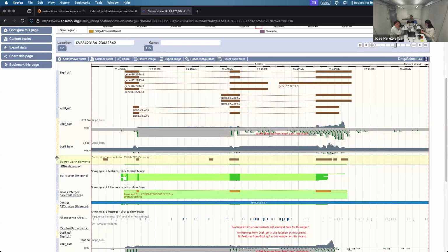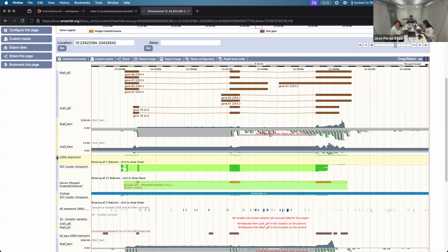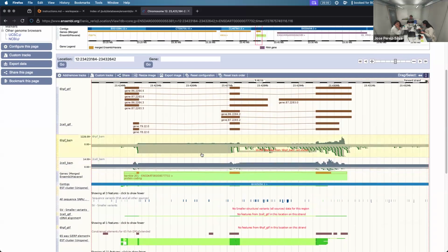So this is one of the things we wanted you to see today, a very quick usage of a little amount of data, and you can already tell how greatly different this specific gene is treated in 2 cell stage and in 6 HPF stage of the development of this species.